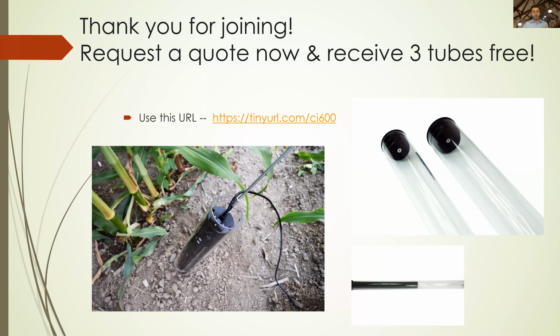We have another question. Do you have to install before planting? I believe it's asking. We do definitely suggest installing before planting. However, we have had researchers install afterwards. It's very much a plant-by-plant dependent situation. If you think your plant would be resilient to having an auger getting too close to it and the tube installed, and it would still grow around it within a matter of weeks, that's going to be fine. If that's going to do detrimental harm to the plant structure, I would not suggest doing that. Ironically enough, what I usually find is that grasses are a lot hardier than things like trees or shrubs.